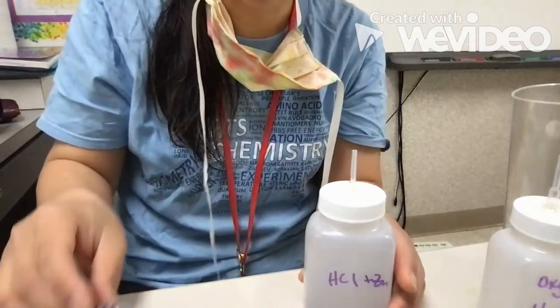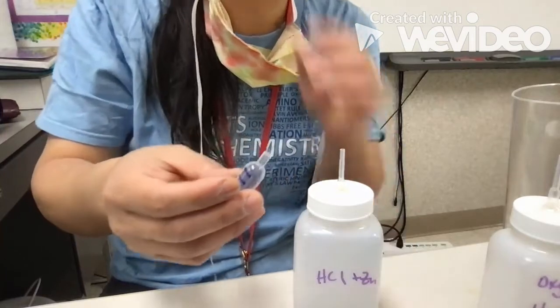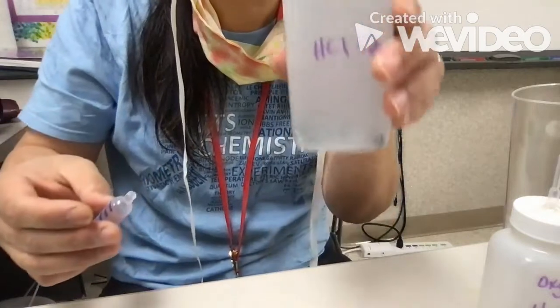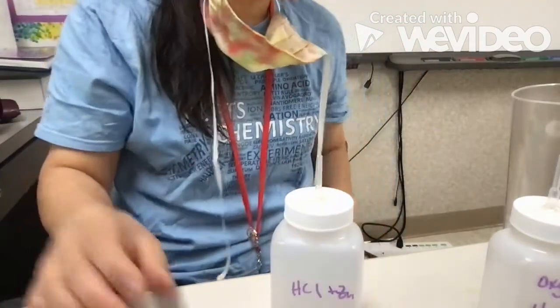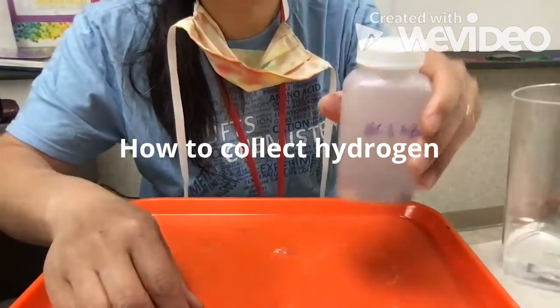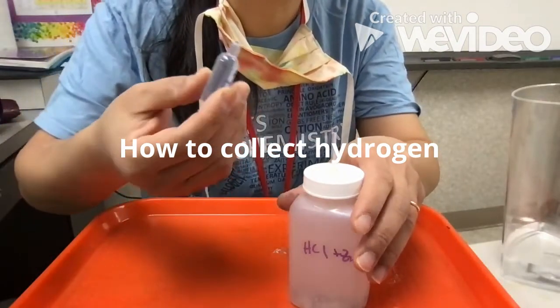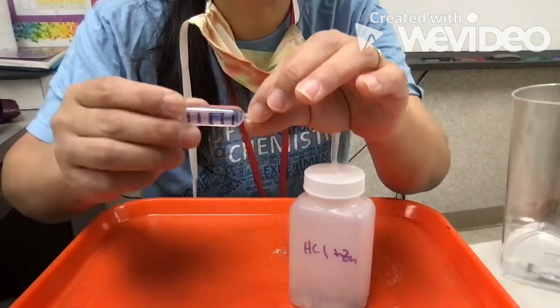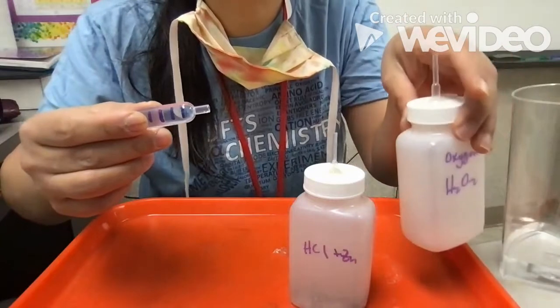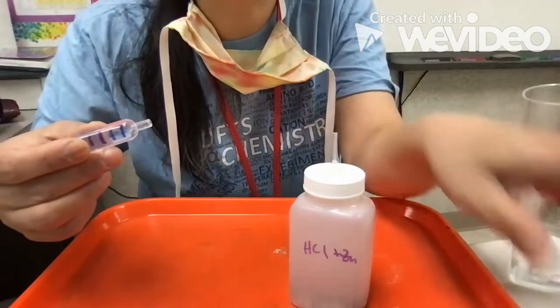Then you have your rocket that's completely filled with water still, and then you're going to add it in, and make sure that when you put your rocket on your hydrogen generator, you have this and this in a bin. So let me grab a bin. Okay, I can see some bubbles starting to form. So now I'm going to start collecting hydrogen here, and you're going to do the same thing with each of your rockets. In the first step, you collect hydrogen, then you'll make oxygen, and then you'll collect a mixture of the two. But the way to fill the rockets is exactly the same.